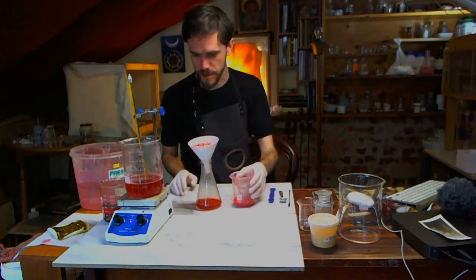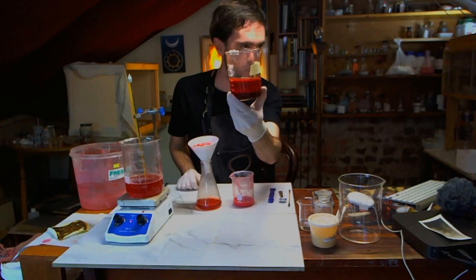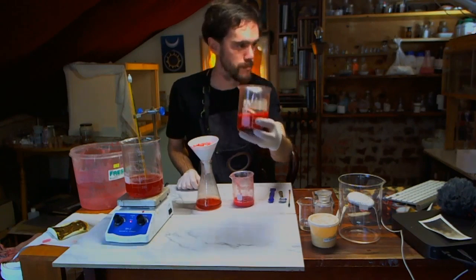Nearly there with this, to a point where I can put it aside, and this has extracted incredible color. Maybe the sodium sulfate wash is the way to go, because that's really cool.